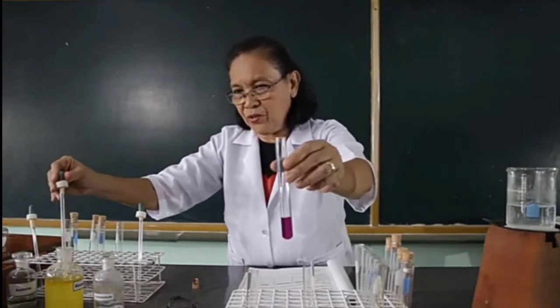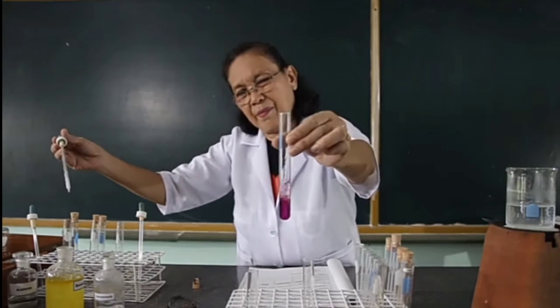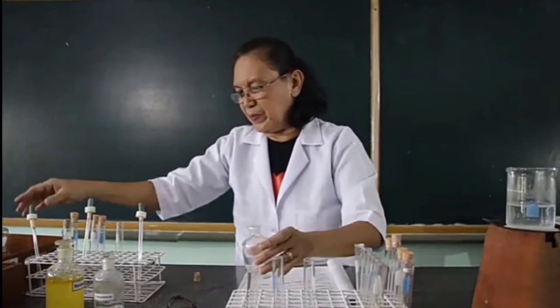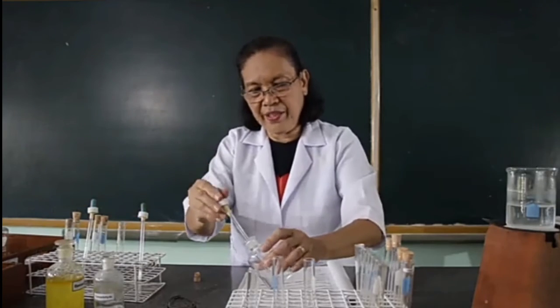To the second test tube, let us add the benzaldehyde. And to the third test tube, let us add the acetone.